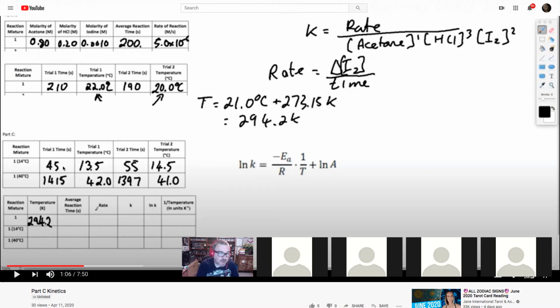And you'll notice the times here. At low temperature, let's see, the trial 1 time. I think I mixed these up. That's unfortunate. Looks like I have to edit that. That won't be as cool. Yeah, I mixed up these times. Ah, dang it. That's unfortunate. That's really embarrassing. Sorry, folks. Right, the time it took for the low temperature should have been a whole lot more than the time it took on the high temperature.